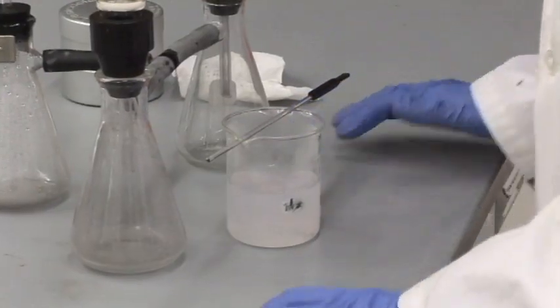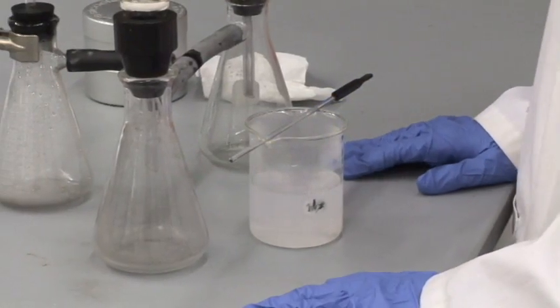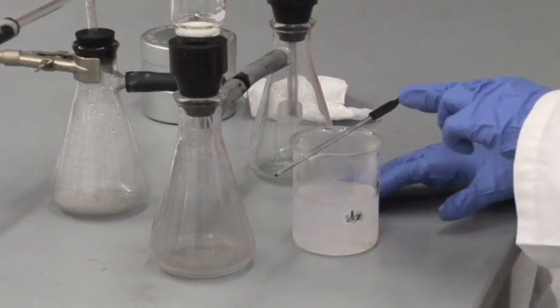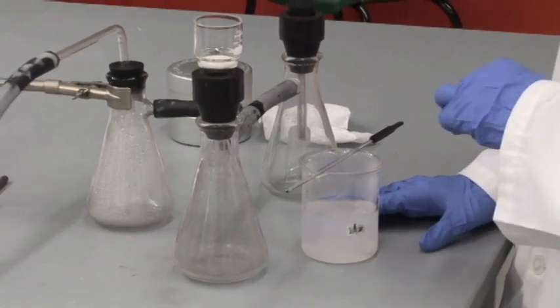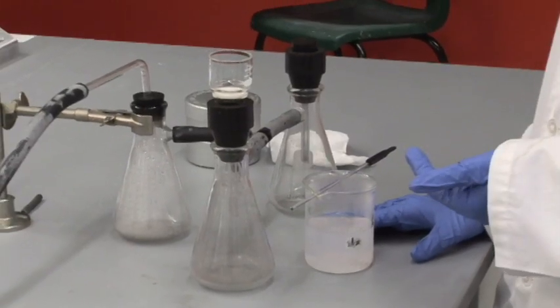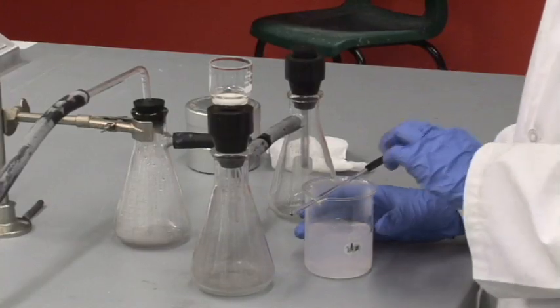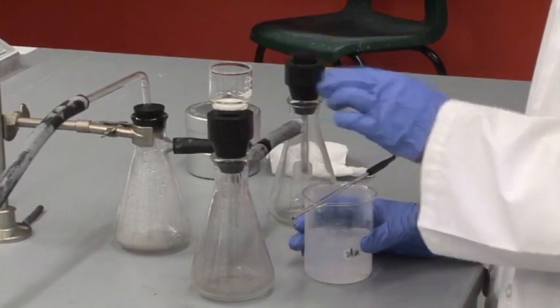The first step is to decant the liquid through the filter. This means you want to get the liquid through the filter but keep most of the precipitate still in the beaker. This is so that it will go a little bit faster if you're filtering just liquid and so that we can rinse the precipitate before transferring it to the filter.